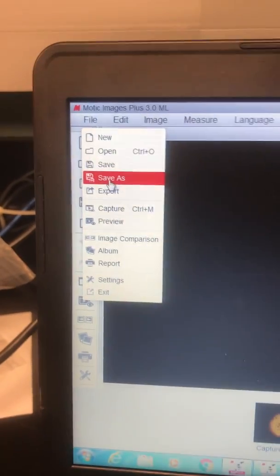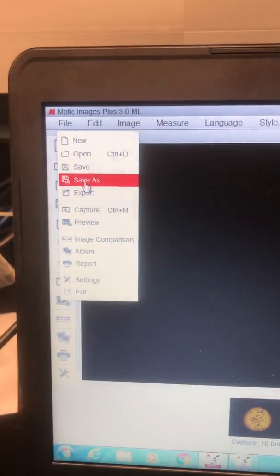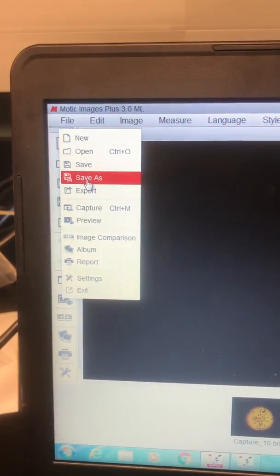And here I accidentally hit it 3 times. But when you click on that image, you can start to see it. This is where you can also save it. So you should be able to link up to your Google Drive and save those images and so forth, and make sure you name them.